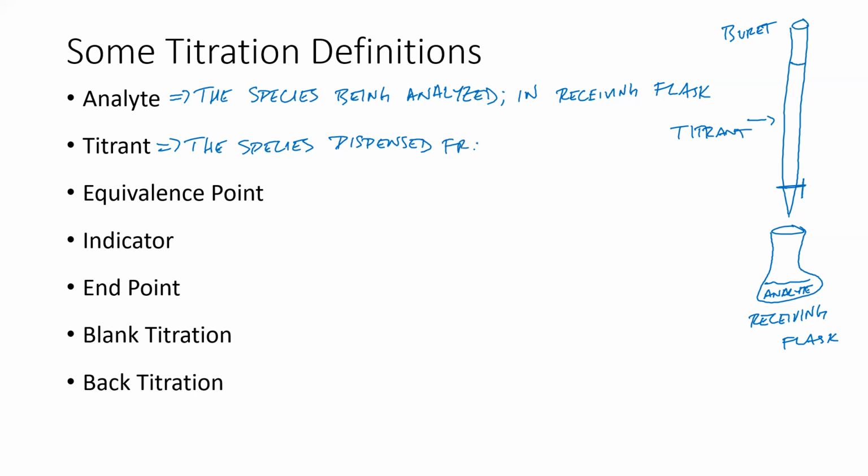From the burette. So analyte and titrant, a lot of times when we talk about analytes, it's our unknown, but not always, especially not in titrations. Okay?